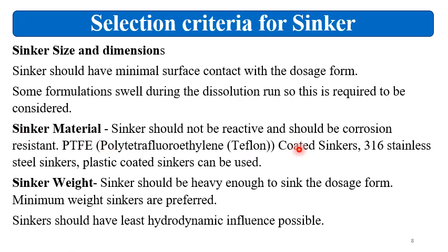Then sinker material. It should be non-reactive and corrosion free or corrosion resistant. Nowadays, stainless steel sinkers are there, coated sinkers are there, then plastic coated sinkers are there. These can be used. Then PTFE, polytetrafluoroethylene, that is Teflon coated, are also there. So these can be tried.